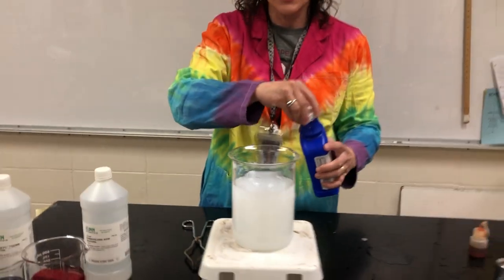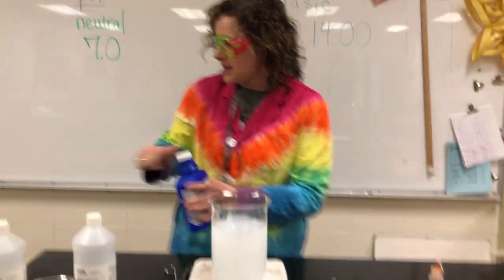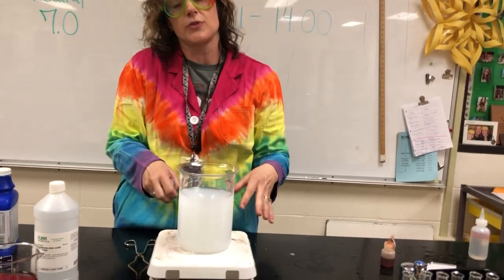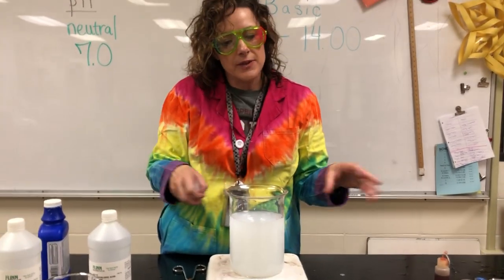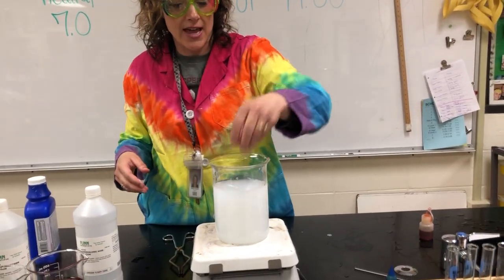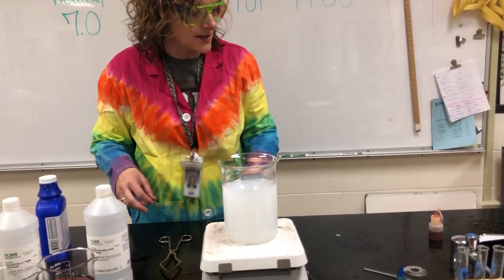Now I'm going to do something else. There was water that was in here. You guys know there's a little stirring rod because I'm too lazy to do it myself. And a lot of times, the colder the temperature, the slower the reaction. And I want it to go slow so that we can see the color changes that happen with this. So I'm going to put some ice in there.